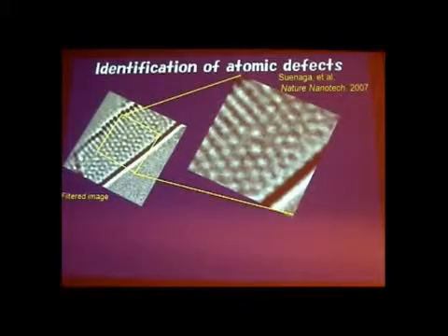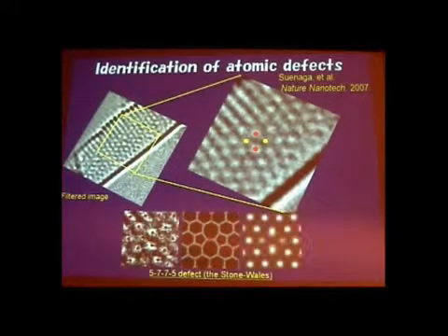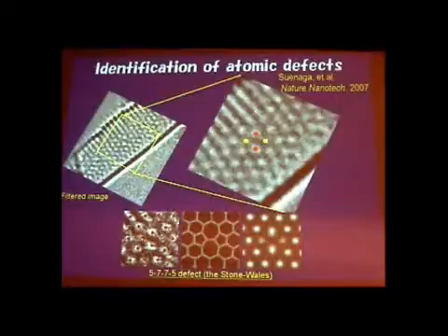And not only the regular regions, but this part somehow has a crystalline defect. So you see pentagonal symmetry here, 1, 2, 3, 4, 5. Because this carbon nanotube structure consists of hexagonal carbon units, we shouldn't see this pentagon. So something happened there. And if you look in detail, then you can find pentagons or heptagons. Others are hexagons. This kind of defect you can get from the microscope. This is very important. In the regular structure, you can use other diffraction techniques, X-ray or neutron. But when you come to defect structures, microscopy is very important, very powerful.